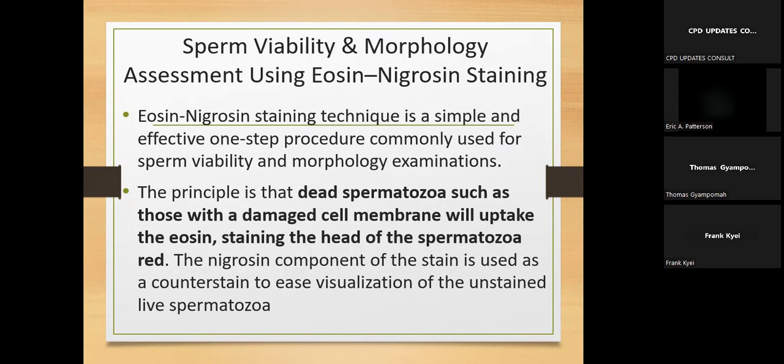Because the bacteria you want to stain are more like the cytoplasm, the bacteria are usually acidic because of their prokaryotic nature, and so the inside is acidic. You usually will need a basic stain to be able to stain it.